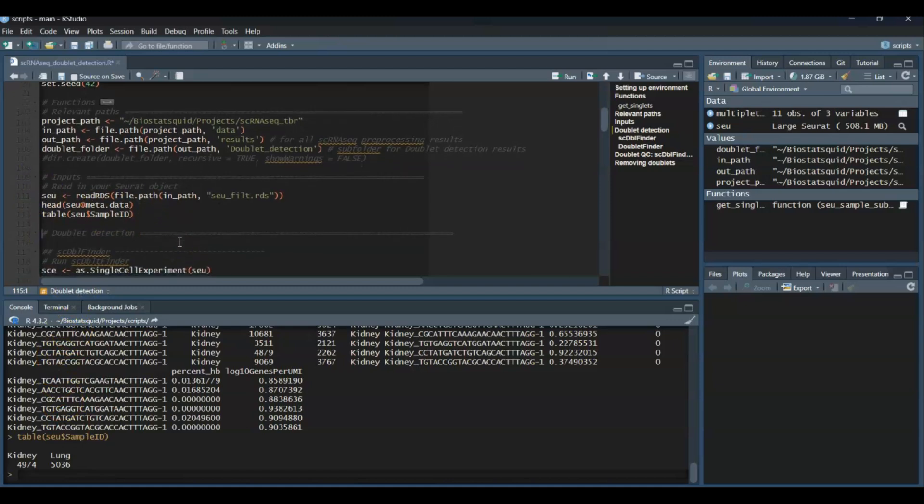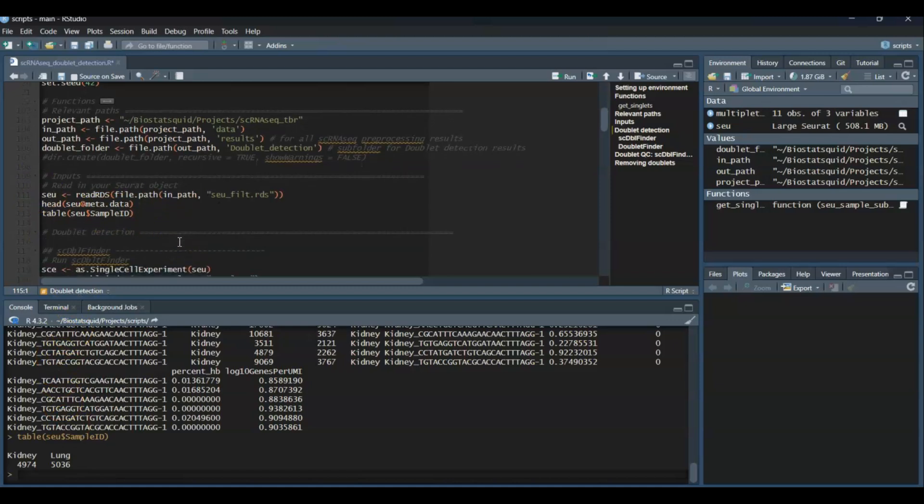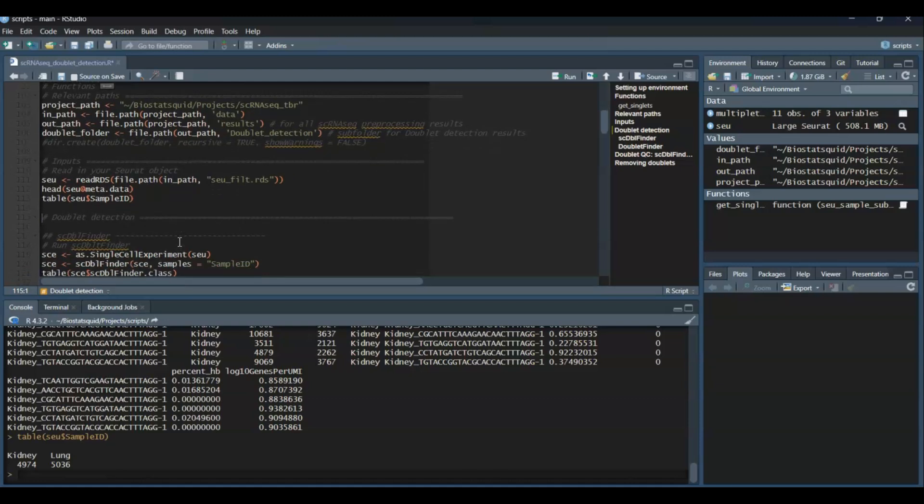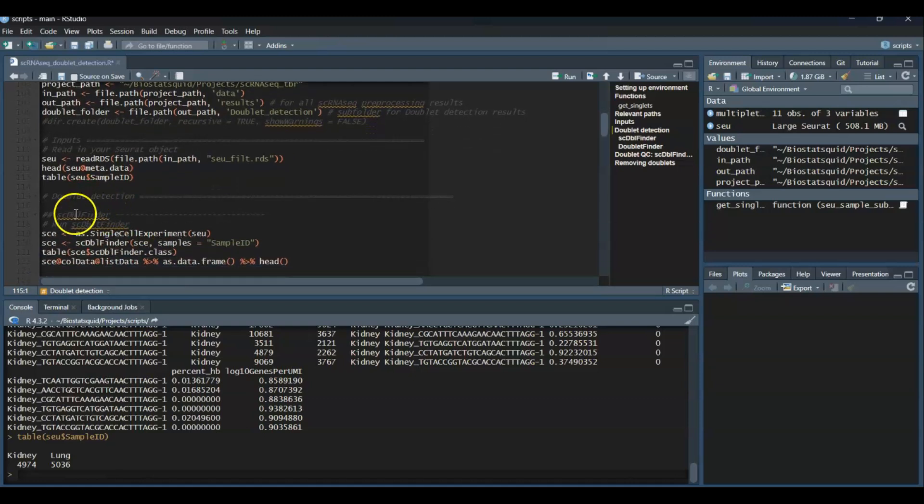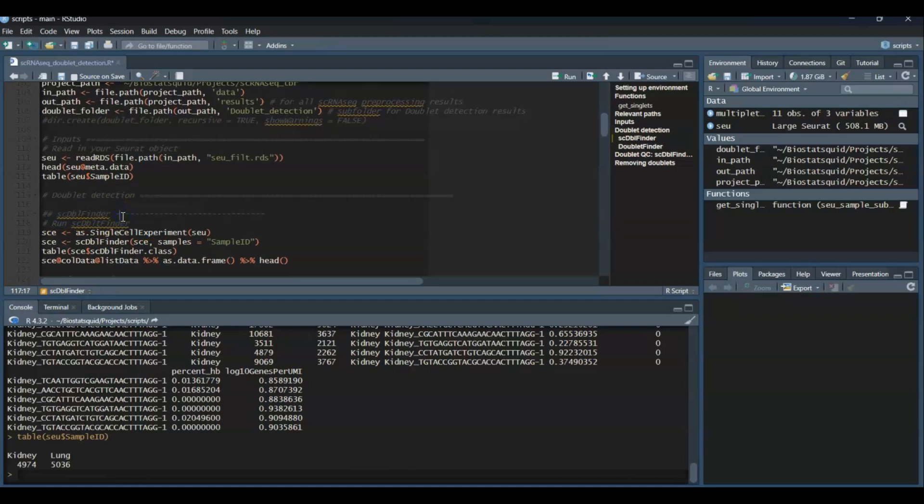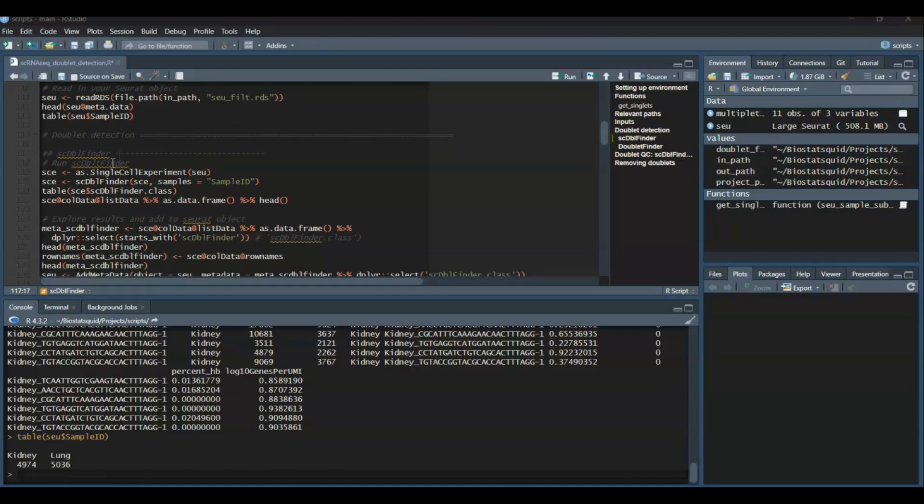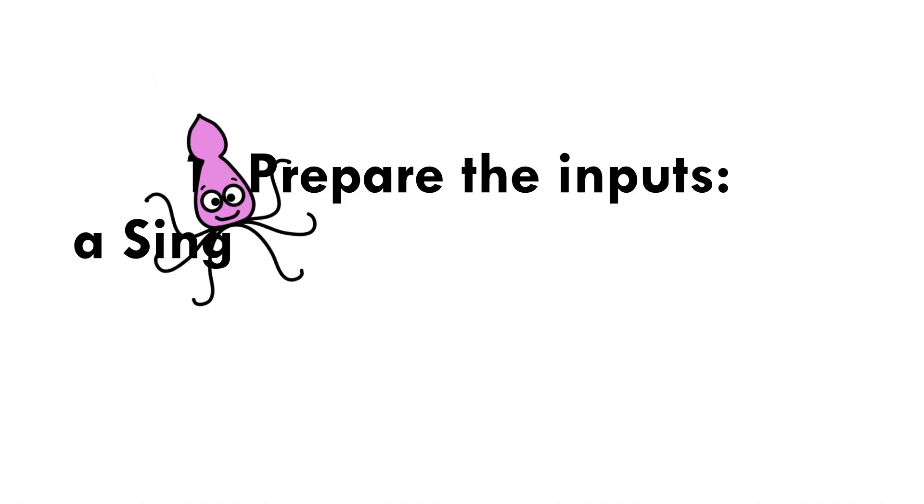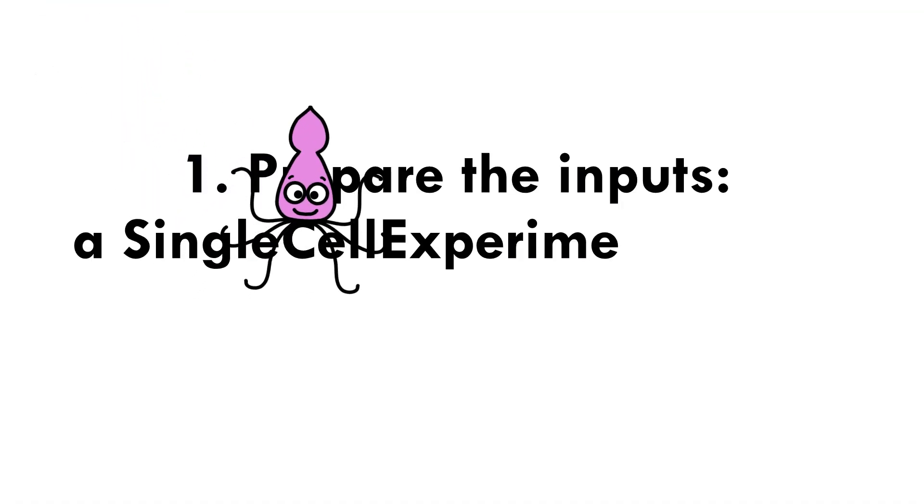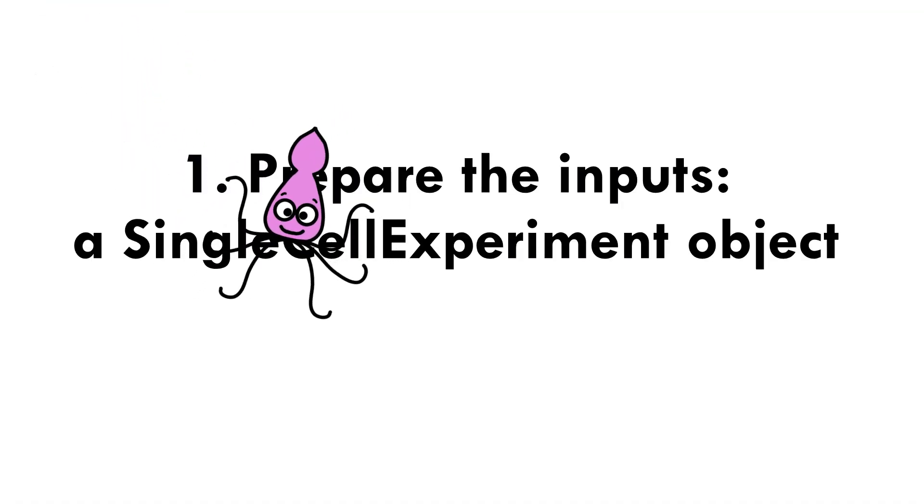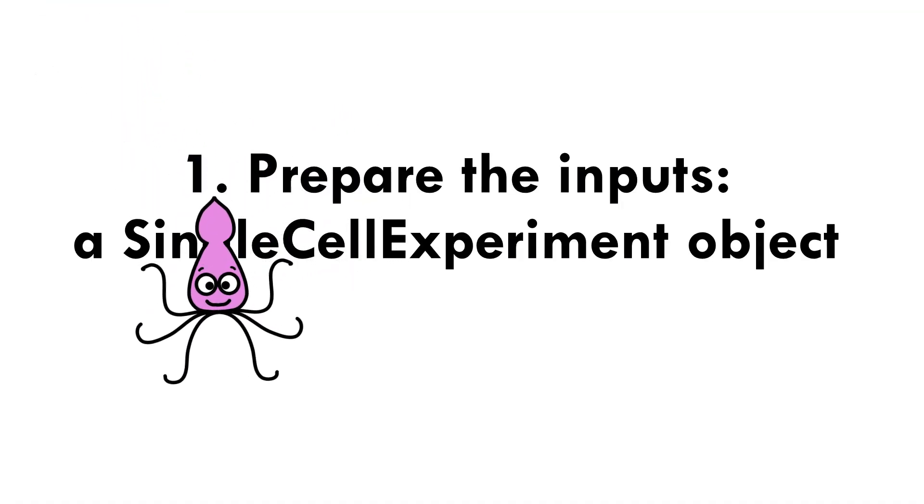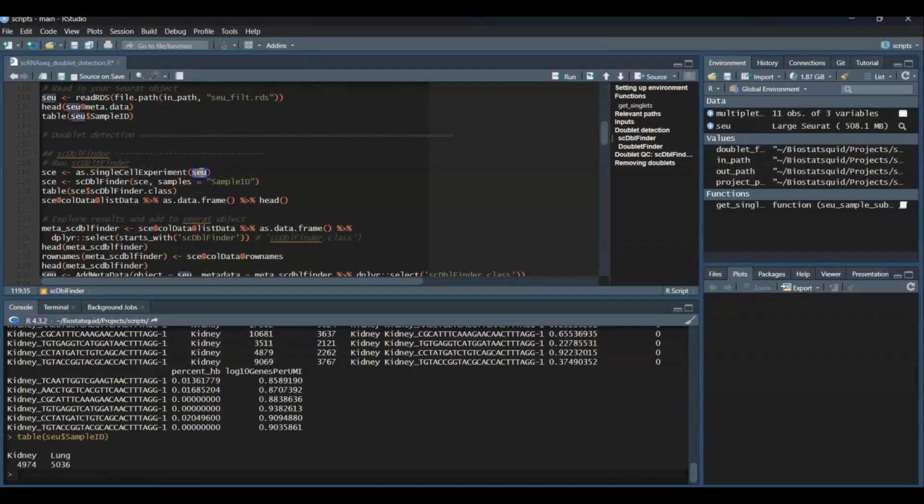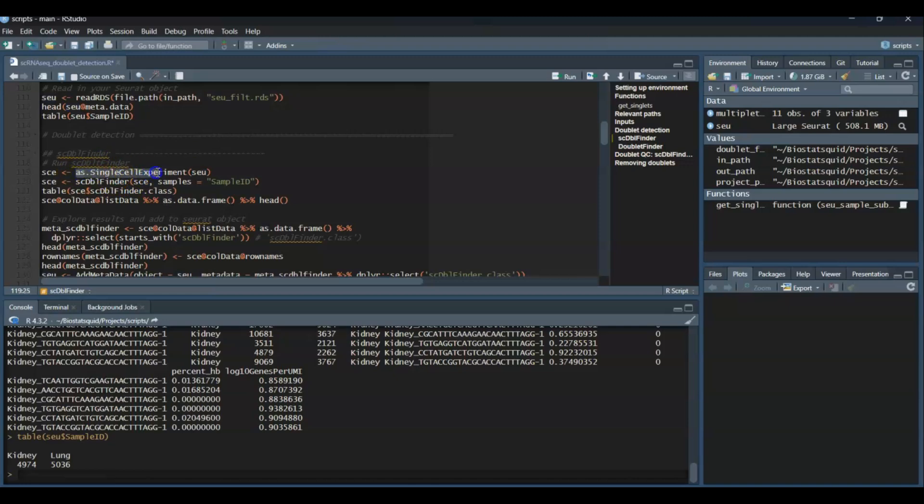Great, so let's start by detecting and analyzing doublets in single-cell RNA sequencing data using the scDoubletFinder package in R. scDoubletFinder takes a single-cell experiment object as input, so if you have your single-cell RNA sequencing data in this format, then great. Otherwise, we need to transform the Seurat object into a single-cell experiment, which we can do really easily with as.SingleCellExperiment.